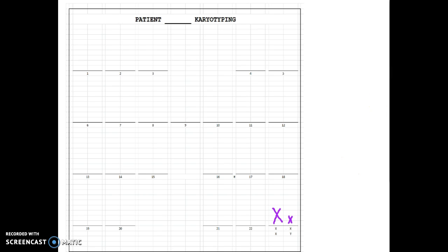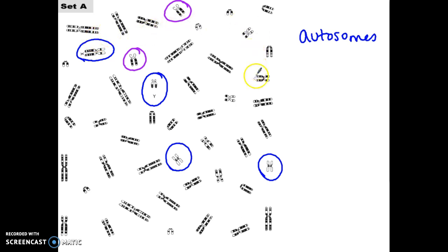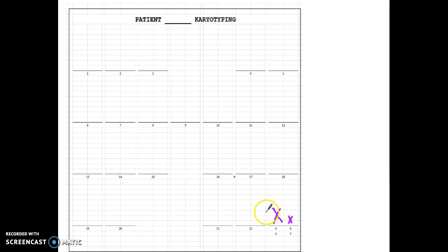And I'm going to hand draw that right here for the X and for the Y. Now, when you're going through, there is disorders out there where unfortunately someone has two X chromosomes and one Y chromosome. If there is another X chromosome in here, it's not going to be labeled as easily as this one is because that other X chromosome will be identical to this one. So if you did a quick look through here, I don't see it. So it doesn't seem like this karyotype does match that particular example. But if there was another chromosome that had this same pattern, then that would be the third chromosome. And you would kind of just squeeze that in here right next to this X chromosome. It would be helpful to diagnosing your patient. That's the whole purpose of this, diagnosing patients with specific disorders.